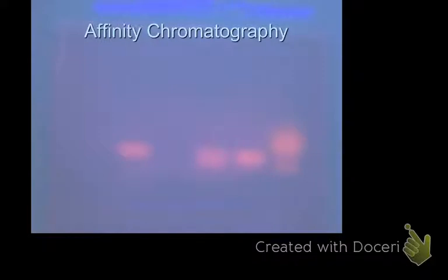Plus and minus, right? Some proteins have more of a positive charge overall, and some are going to have more of a negative charge, and so that's at the extreme. And those are called cation and anion exchange. Okay. Then pH is really just a type of ion exchange. You can also deliberately clone a tag.